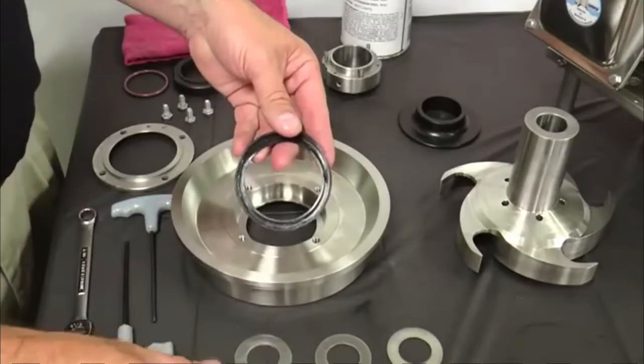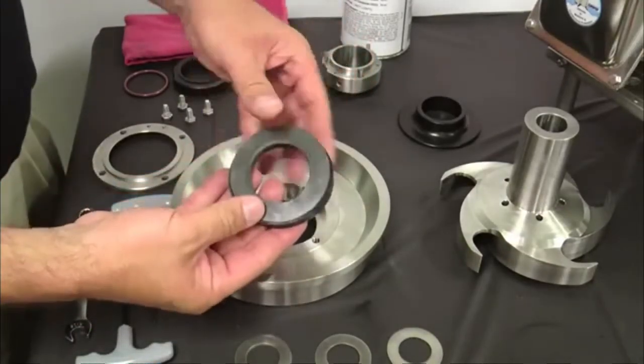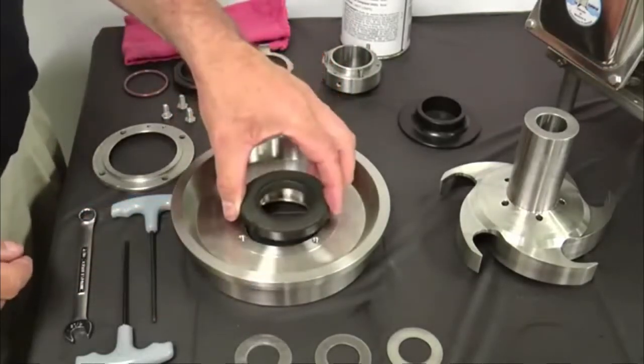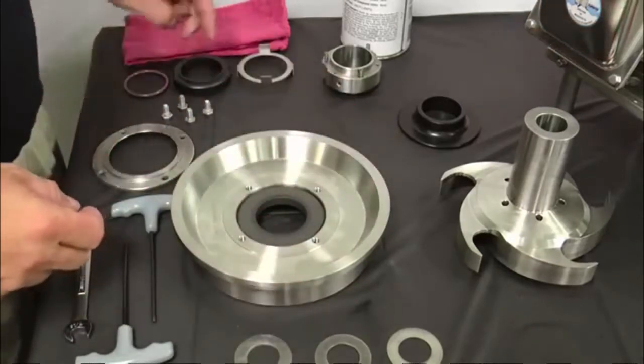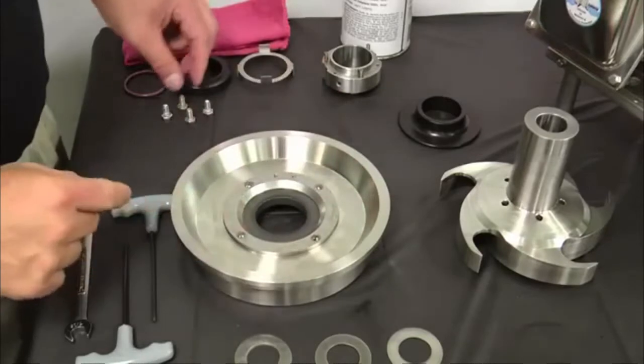Lightly lubricate both sides of the L-gasket with a sanitary lubricant and insert it into the back plate seal cavity. Place the stationary seal with the seal contact surface facing up into the L-gasket and insert into the back plate. Place the seat retainer over the stationary seal.